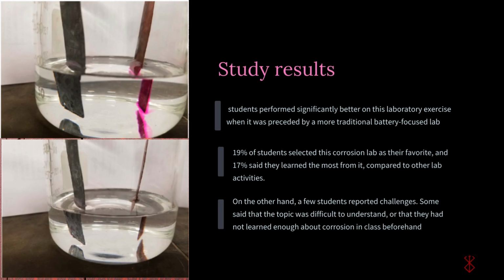After completing the corrosion lab, students demonstrated a deeper understanding of electrochemical concepts, and the results were measurable both academically and through student feedback. According to the article, students performed significantly better on this laboratory exercise when it was preceded by a more traditional battery-focused lab.